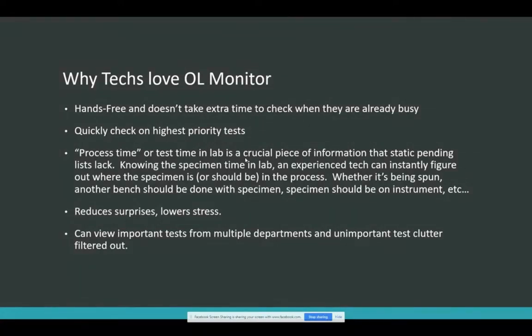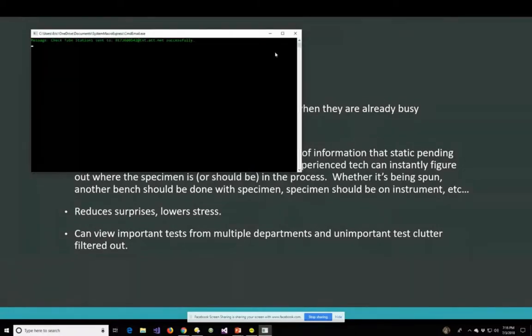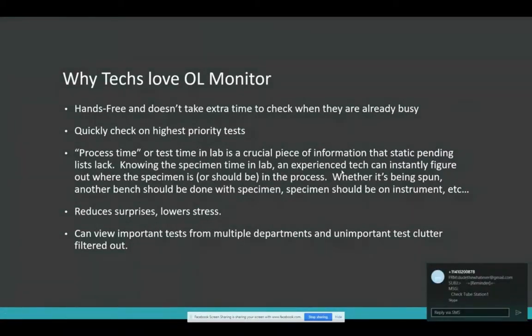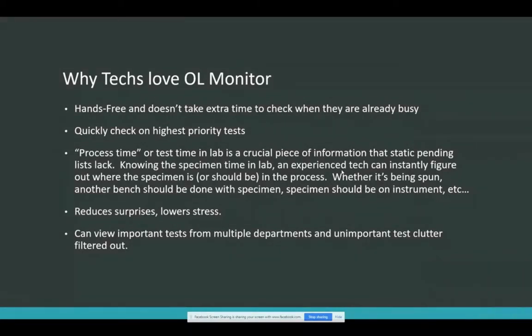One thing that's missing from those reports is the process time. They display the collect time or the receive time, and then you just have to sit there and do a little mental calculation for each and every test about how long it's been in the lab. That's great for your math skills, but it's time consuming. This process time is next to every single test, and we can use it to sort the list so that you know which tests are oldest and which ones need attention.